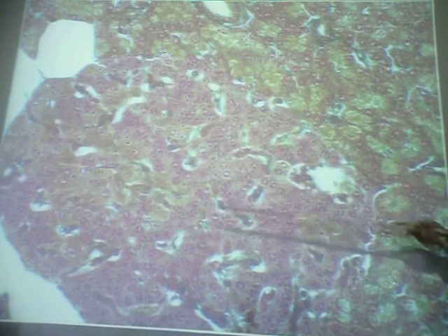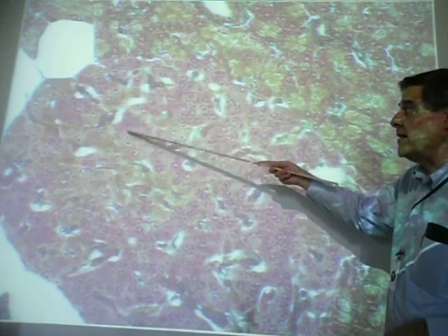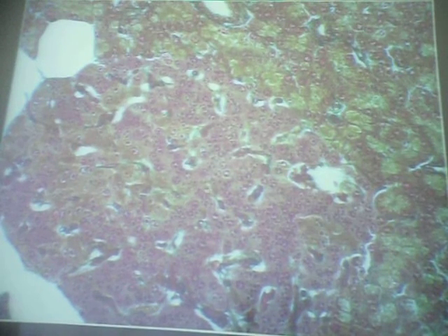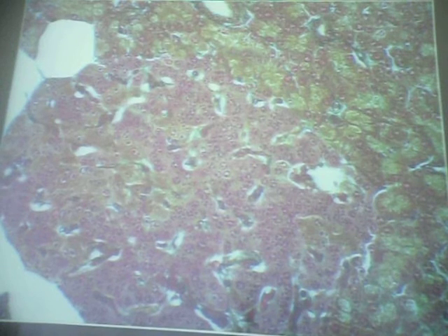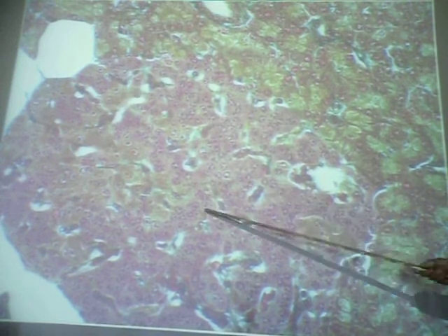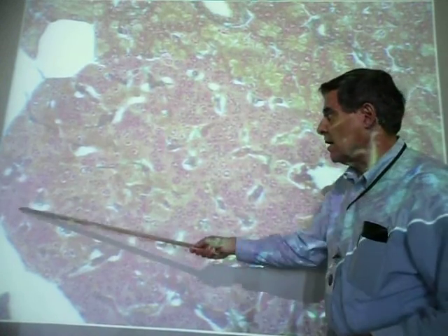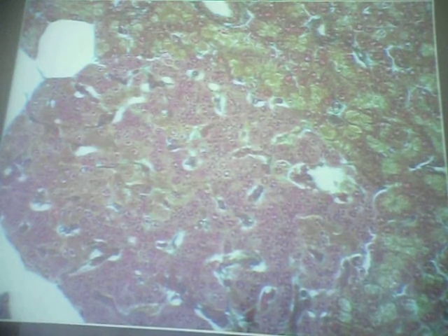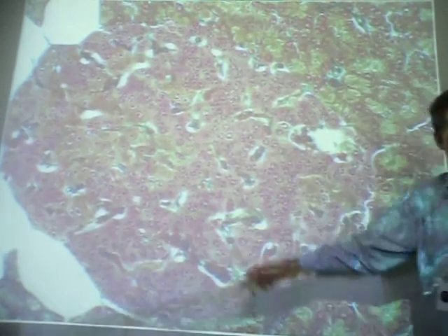Okay. The major cell type here has a red or violet color cytoplasm. Those are called beta cells. It's the beta cells that produce insulin. We've already talked about what insulin does. So these reddish stained cytoplasm cells, which are the most abundant in here, are called beta cells, and they produce the insulin. Which are the islands? The red area here, that's the pancreatic islet. And again, the major cell type here are the beta cells.